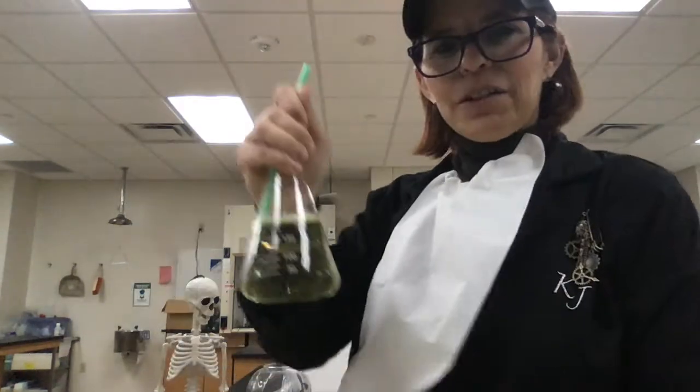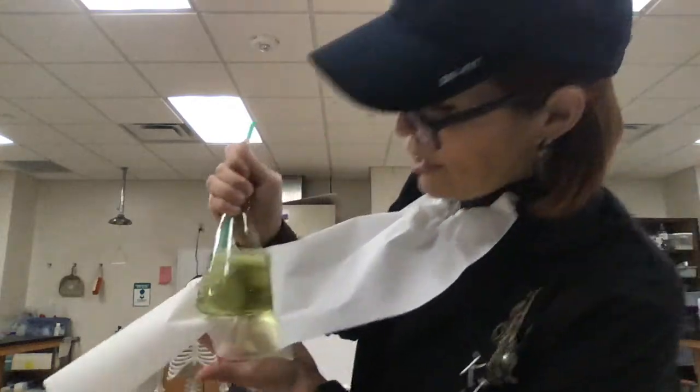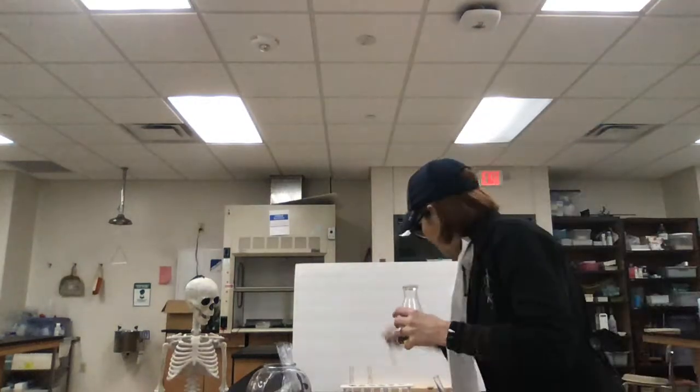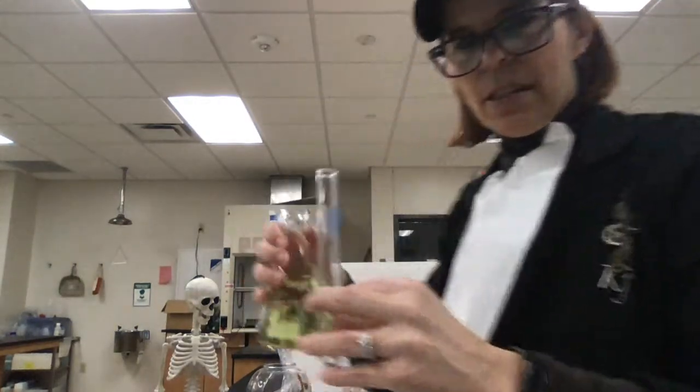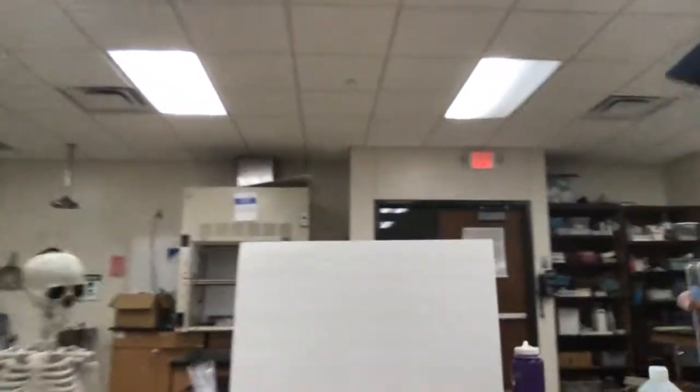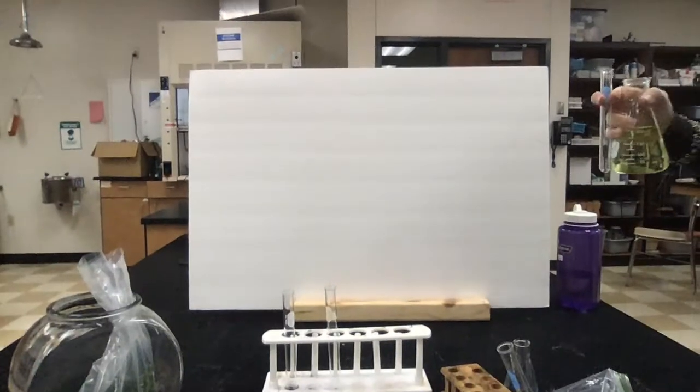All right, do I have a yellow enough color? I think so. Can you see that that's a nice yellow color? I'm going to go ahead and pour that into my test tubes. So hopefully you can see me. Maybe I should do this. I'm going to scooch this really close and do it as much in front of the white background as possible.